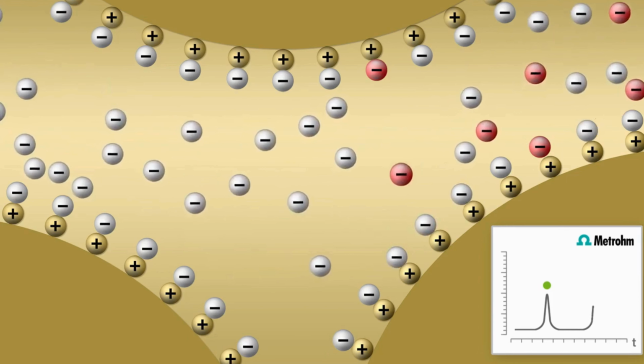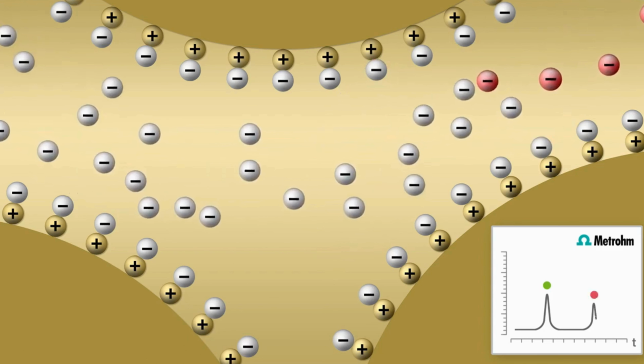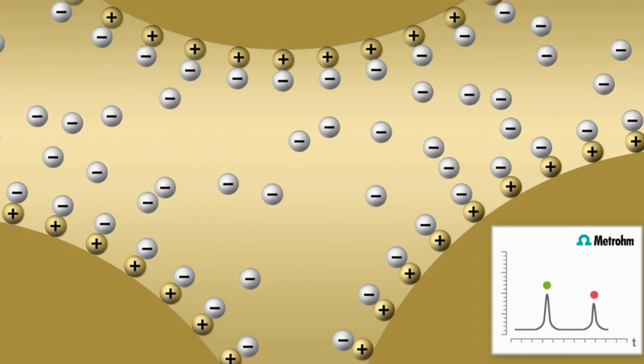IEX is important in analytical chemistry, protein purification, water treatment, pharmaceutical processing, metal ion separation, environmental analysis, and modern ion chromatography.